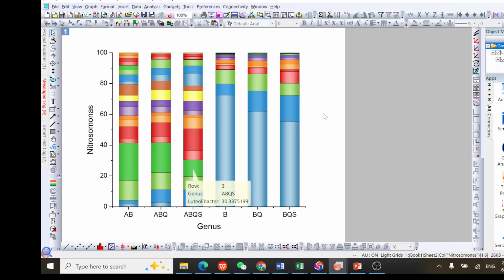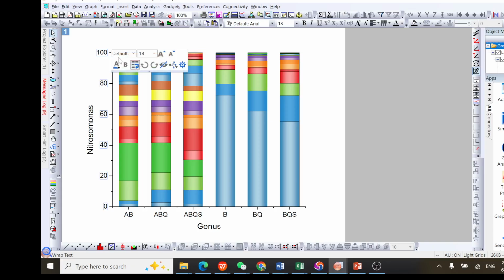So we continue with the beautification. We have to work on the figure, on the labeling. So how do you do that? You click on the labeling. Then some people have shortcuts, some don't have shortcuts. Like me, I have a shortcut like this. It can appear like this. I can work on this like this.